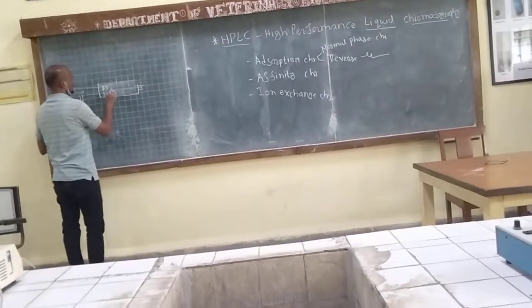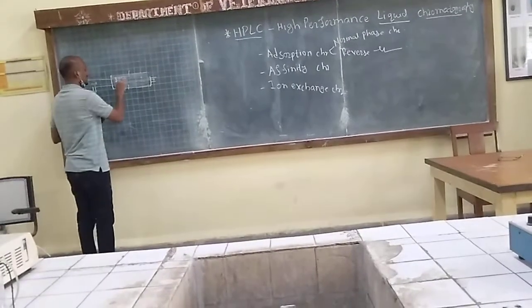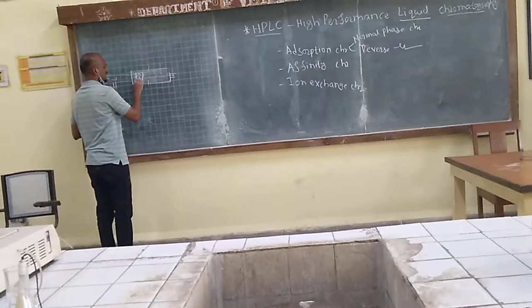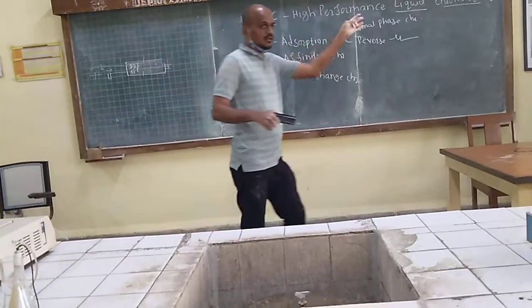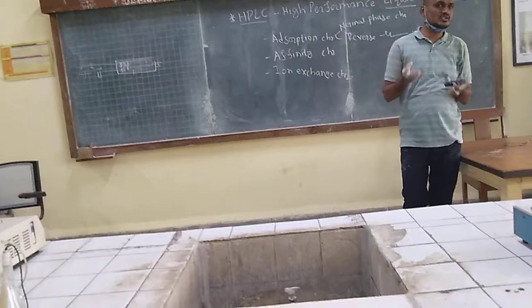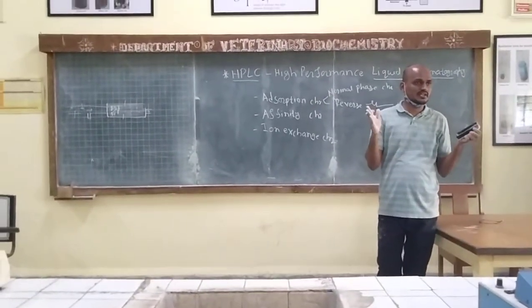So here we will attach an antibody. It has an affinity only for A. So now this A will go and bind with this antibody. Other molecules won't bind. In that way, all other molecules will elute first, and afterward you will put in elution buffer in such a way that the affinity between these will get broken, right?